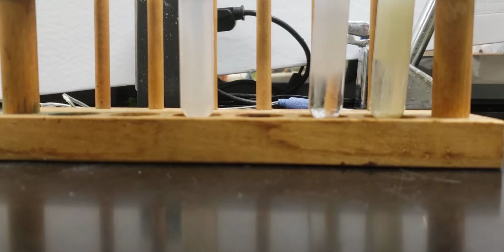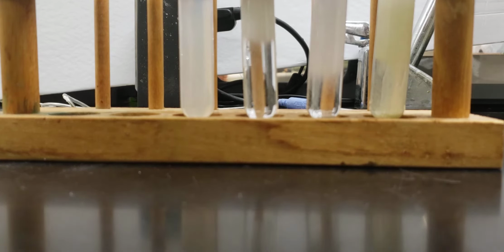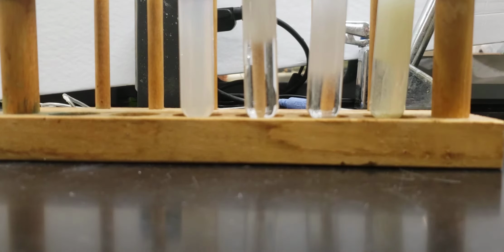So the next thing that we're going to do, besides shaking these up here, is that we have a second test that we can do. And the second test that we can do is that we can add a little bit of ammonia to each of these, okay?